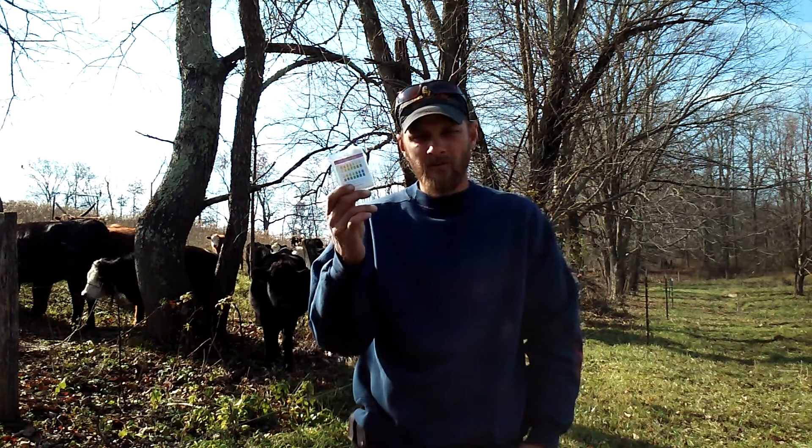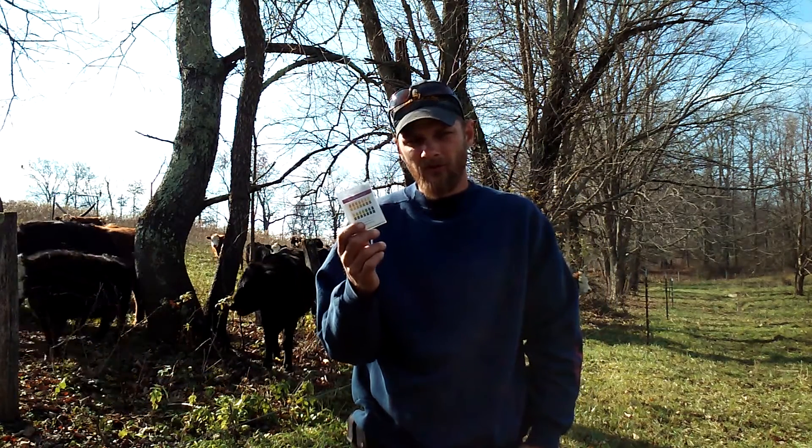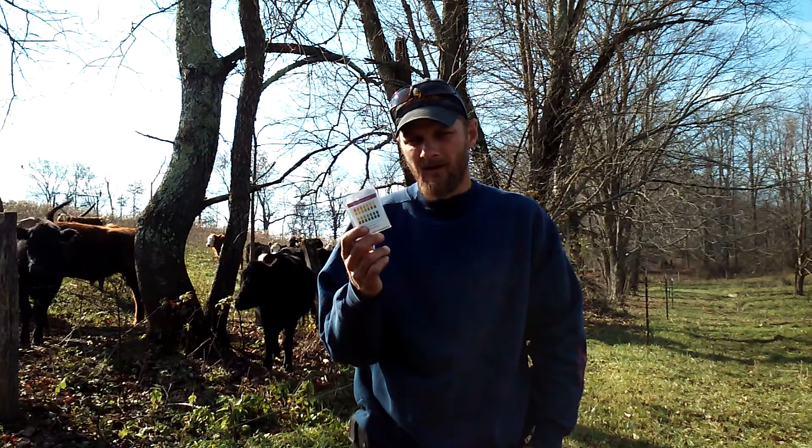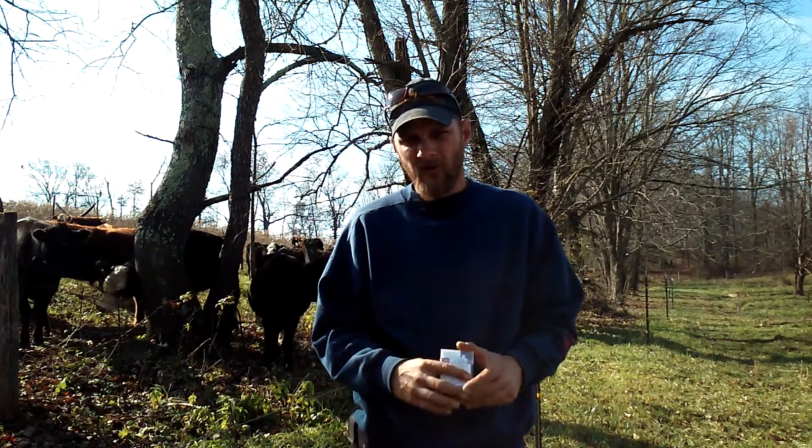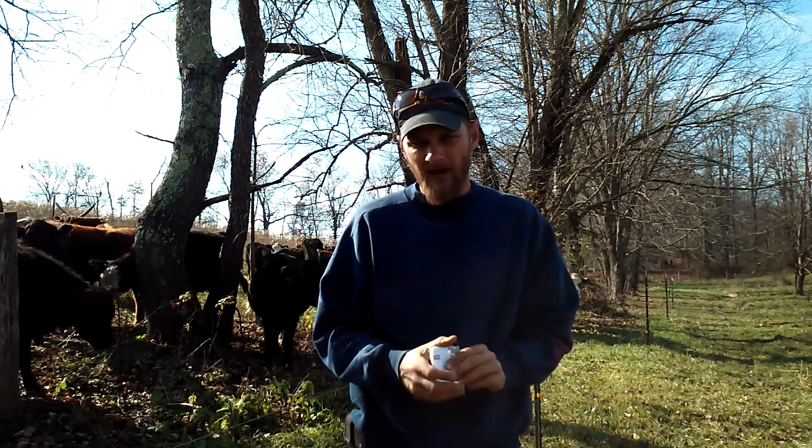Just using some simple urine pH strips you're able to check the cow's rumen and see what's going on inside the cow. This can do a few things for you. If you do intentional grazing or rotational grazing, this will help tell you how fast to move the cattle — if you're moving them fast enough or if you're moving them too fast.